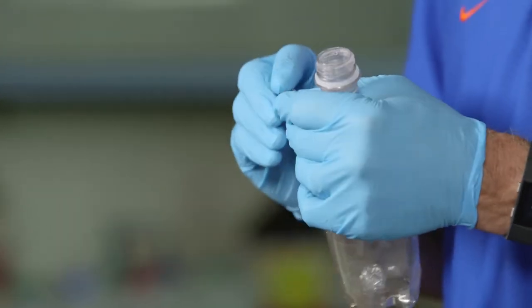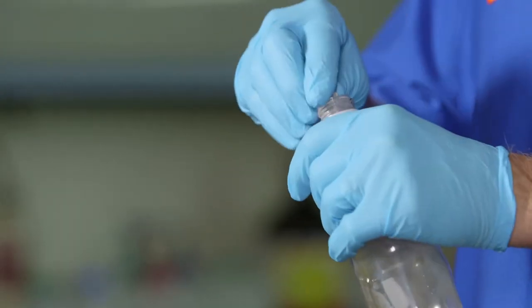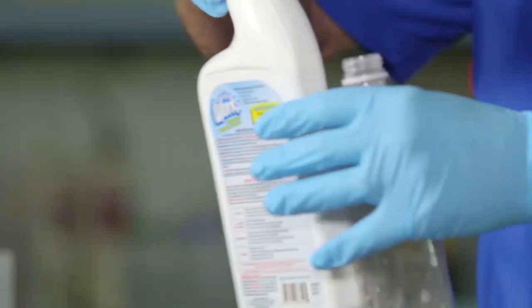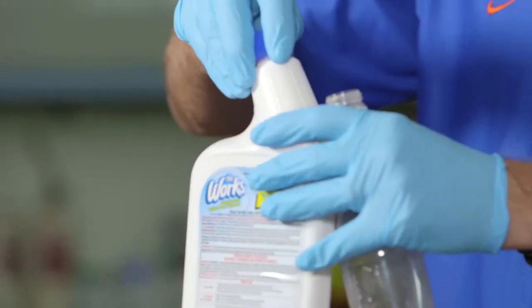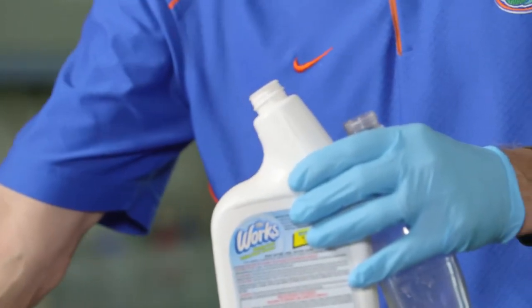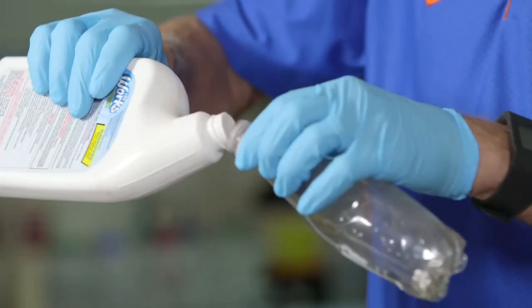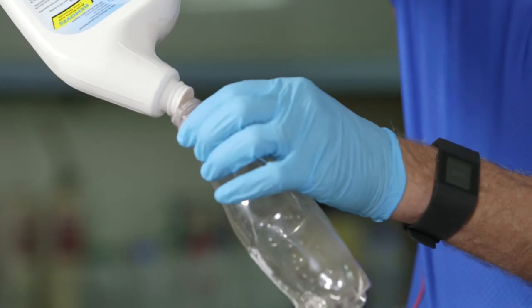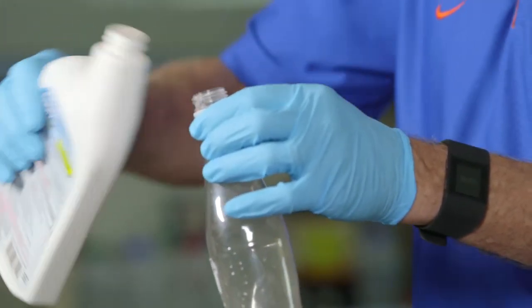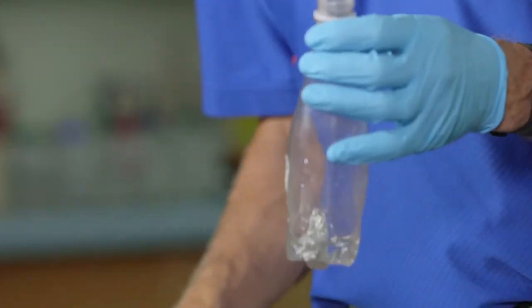I'm going to take a few little pieces of aluminum foil and put them in here. Then I'm going to take some solution — this stuff is The Works, which is basically a hydrochloric acid solution. I'm going to take some of that hydrochloric acid and pour it in here. What happens is that hydrochloric acid is now going to react and cause corrosion of the aluminum.